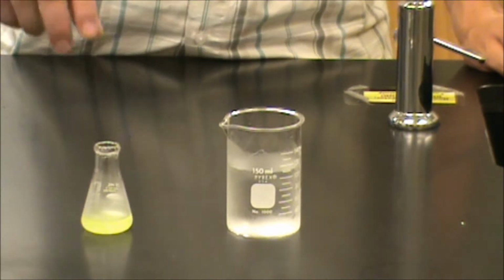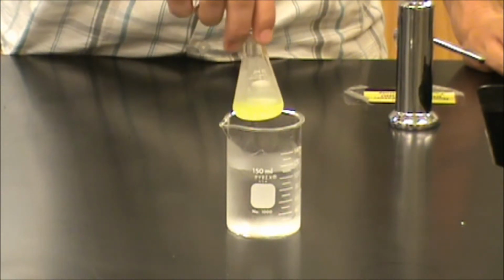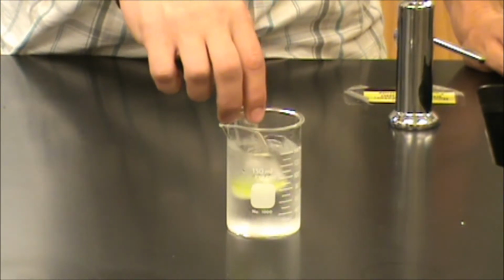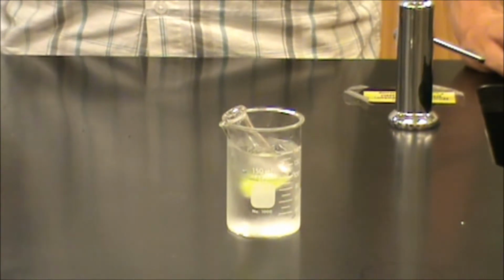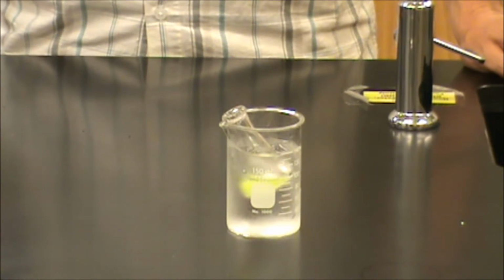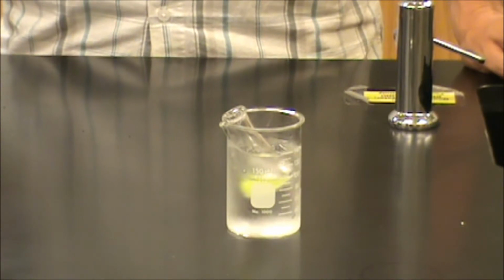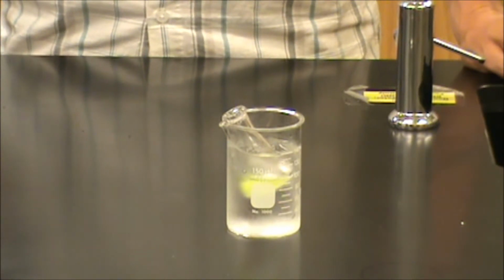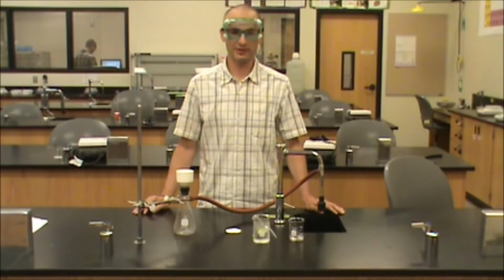I am now going to transfer our small Erlenmeyer flask to an ice bath I've created in the 150 milliliter beaker. Notice I've used the 150 milliliter beaker because it's too narrow to allow the Erlenmeyer flask to tip over. The ice bath is composed simply of ice and water. The Erlenmeyer will remain in this ice bath for approximately 5 to 10 minutes. Our crystals are now ready to filter.